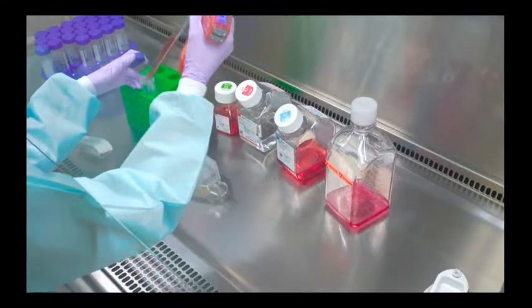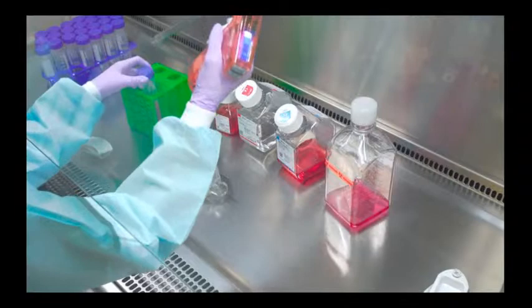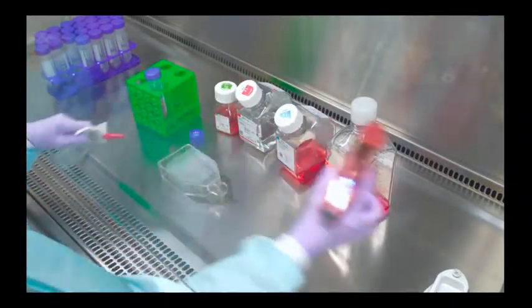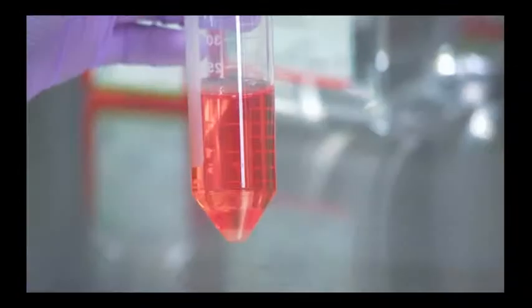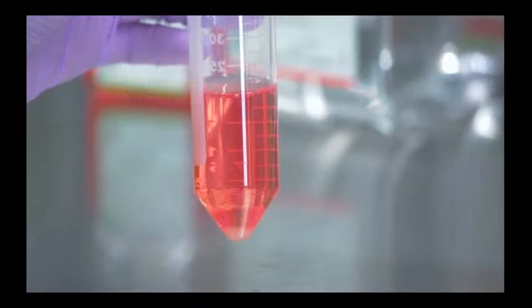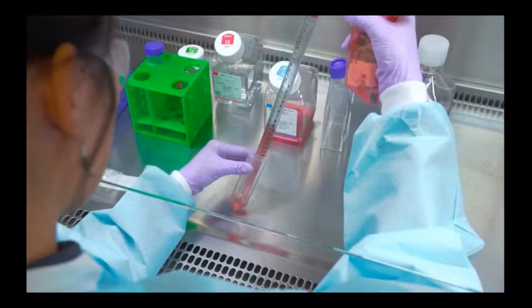Transfer the cells to a conical tube and centrifuge to remove any residual dissociation reagent. The speed and time of centrifugation will vary based on your cell type. After centrifugation, you should have a well-formed pellet. Remove the medium from the centrifuge tube with a pipette and discard the medium into a waste container. Try not to disturb the pellet.